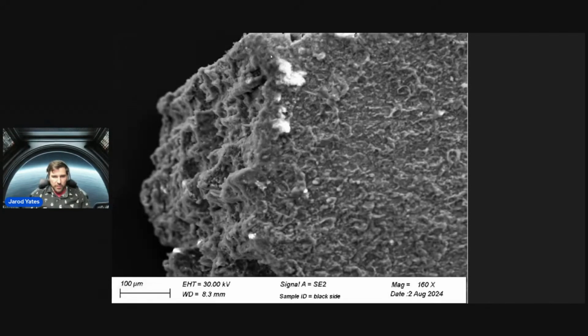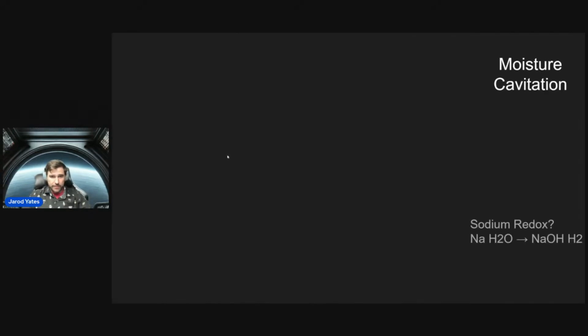Here we are up a little bit higher, still on the bismuth side here, and we got the brightness turned all the way up to max at 30 kV. And now you can really see this edge structure here really well. We're focused on this line right here. And you got some of these sharp spikes coming off, but most importantly, you can really start seeing the angles of the shearing that occurred when this thing was peeled off of whatever it was peeled off of. Yeah, I think there is much to be gleaned from observing the edges of this thing and how they break.